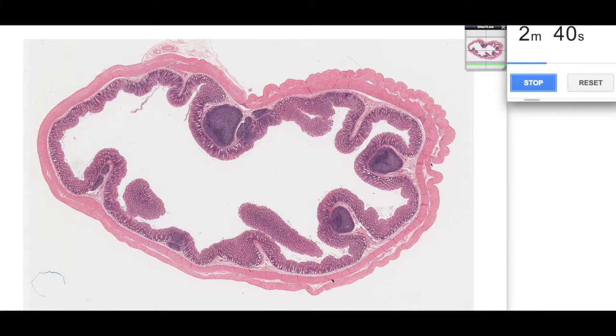Now in humans, the outer longitudinal layer of the muscularis is arranged into three bands called tinea coli. So they'd be sort of large extensions associated with the outside layer of the muscle. We don't see that, so this is from a non-human mammal.